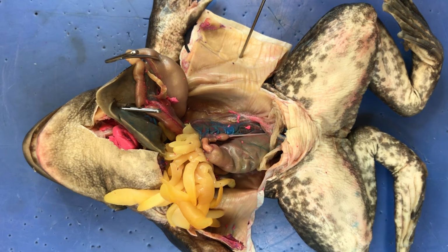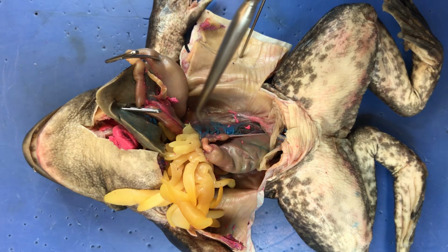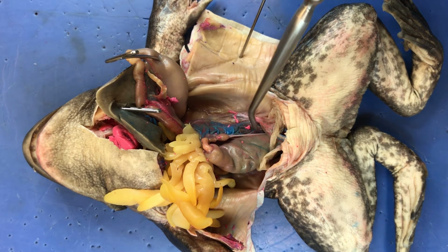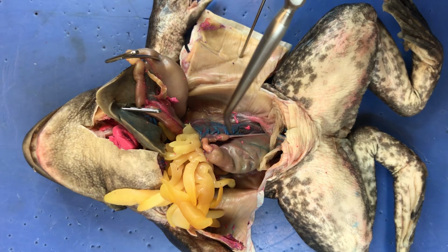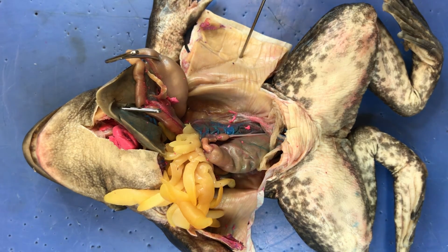Here, we will investigate the urogenital system of the frog. The urogenital system consists of paired kidneys. The left kidney is seen here. In the male, the posterior portion of the kidney produces urine.